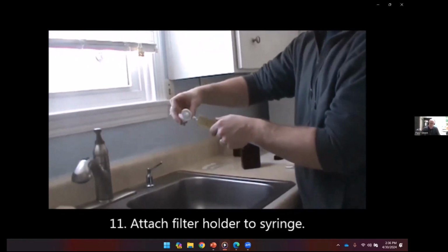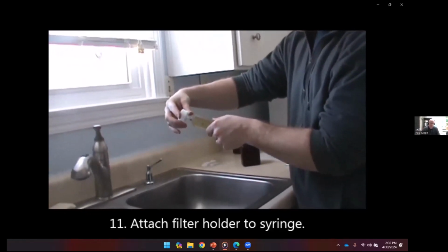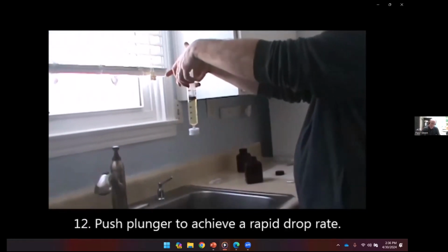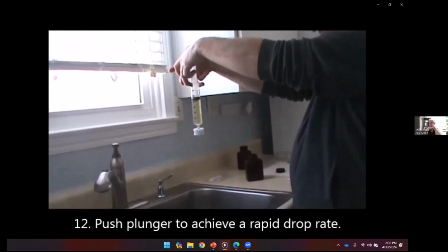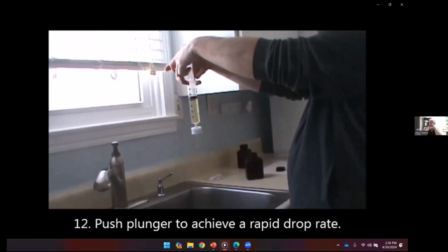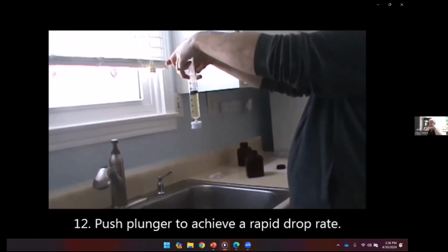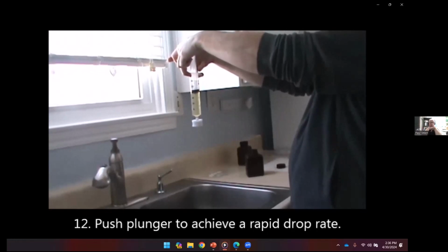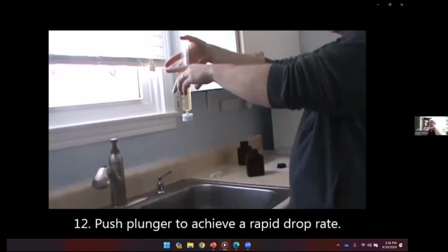Like the tubing, it won't snap into place, but you can get it to fit snugly. Slowly push the chlorophyll sample through the filter holder and adjust your pressure to achieve a rapid drop rate. Pushing too hard may rip the filter, so avoid excessive pressure. As you push the plunger, make sure that no water is leaking out the side of the filter holder.